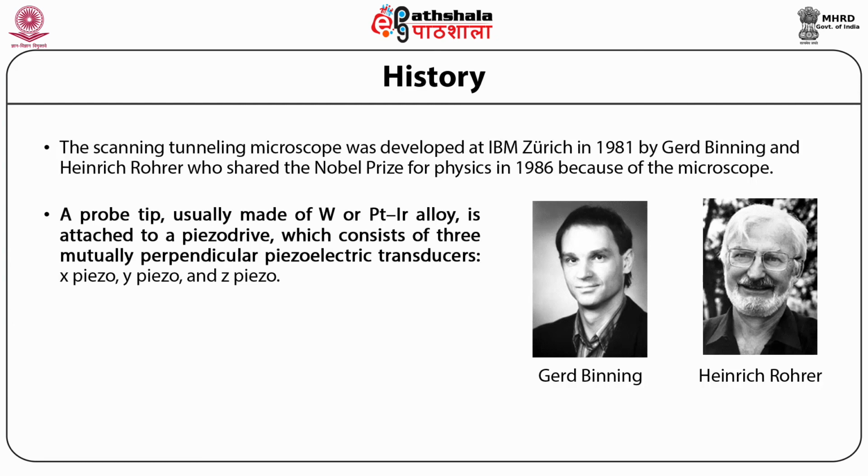Here a probe tip, usually made of tungsten or platinum iridium alloy, is attached to a piezo drive, which consists of three mutually perpendicular piezoelectric transducers: X piezo, Y piezo, and Z piezo.